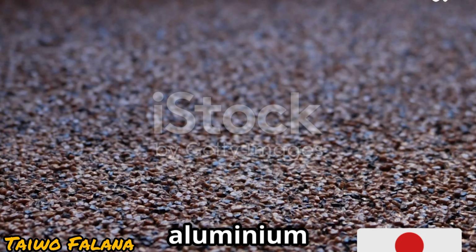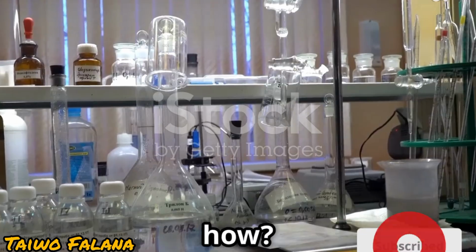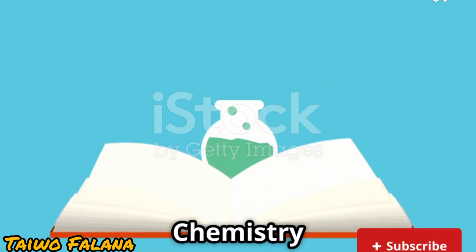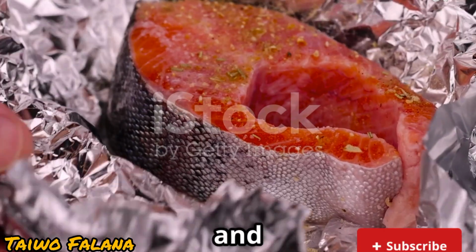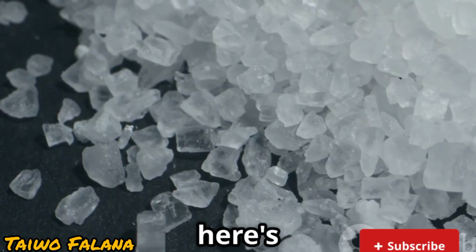If your aluminium foil turns white when exposed to gas, you're witnessing real chemistry magic. Curious how? Stick around. Hey everyone, welcome back to KC Channel Schooly, your go-to spot for KCSE chemistry tips. Today, let's break down the classic reaction between hydrogen chloride gas and aluminium foil, an experiment that shows just how cool chemistry can get. So here's the setup.